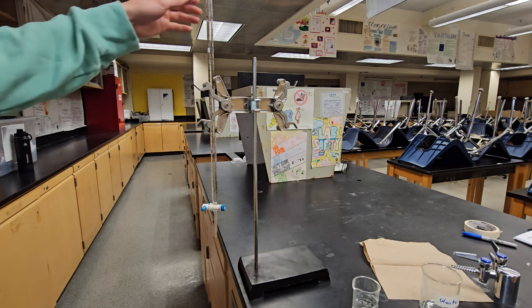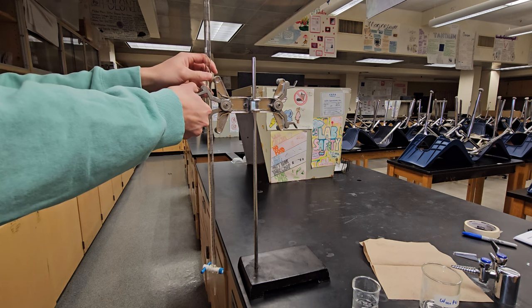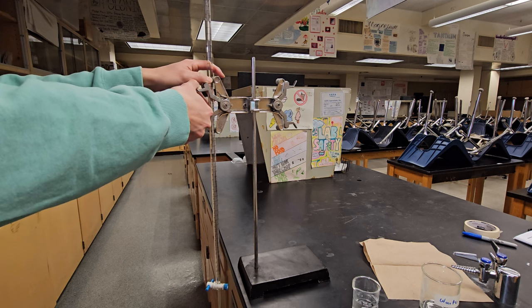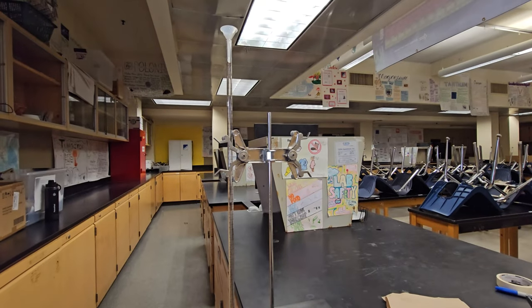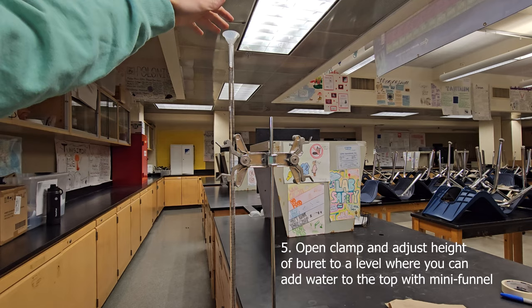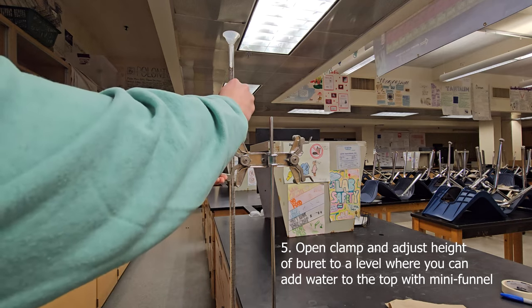Grab the burette with one hand, open the clamp, and lower the burette to a height where you can comfortably pour water into the top from the beaker without tippy-toeing. Depending on your height and what's comfortable for your group, you can adjust the height accordingly.